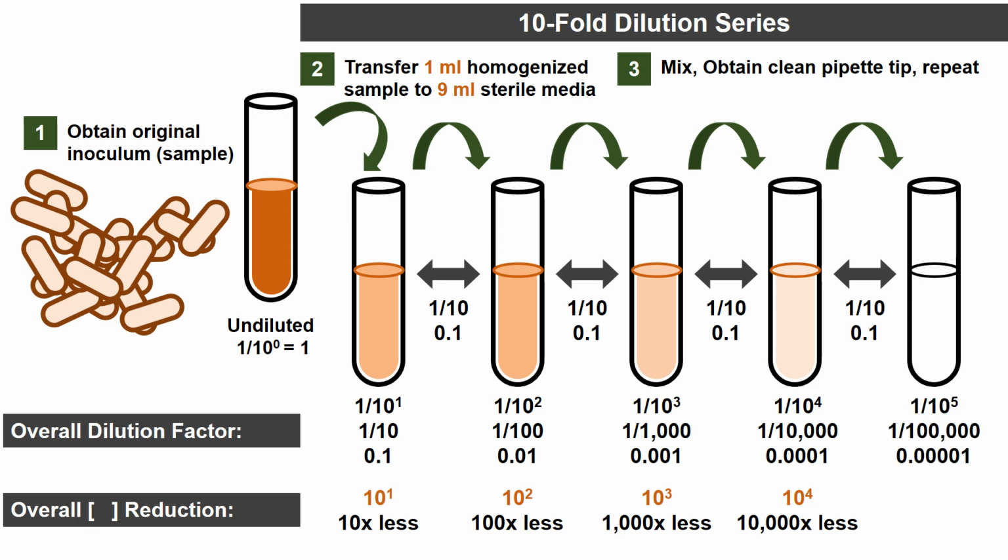This is the fifth tenfold dilution, so its overall dilution factor is 1/10 to the fifth relative to the original sample. That is 1 divided by 100,000, or 0.00001. Sorry, I had to keep track of all those zeros.